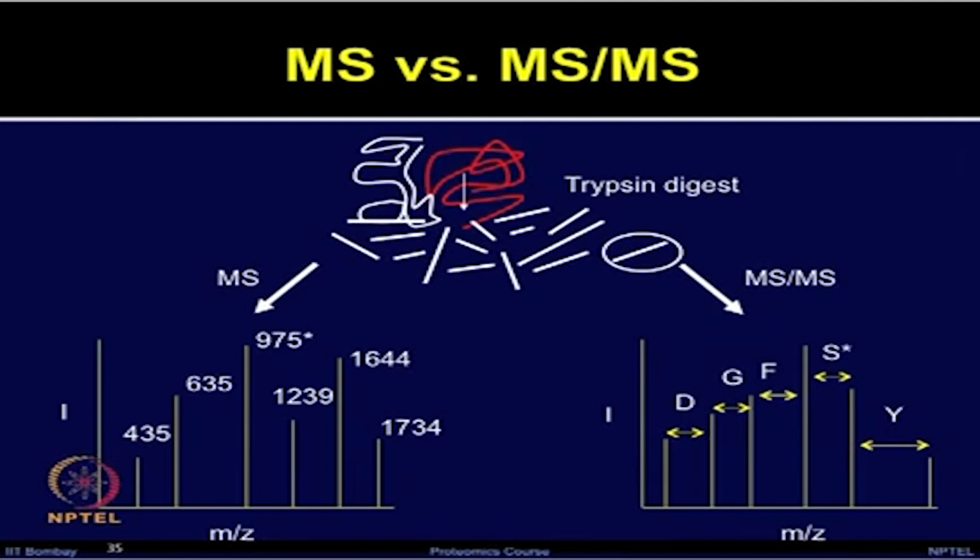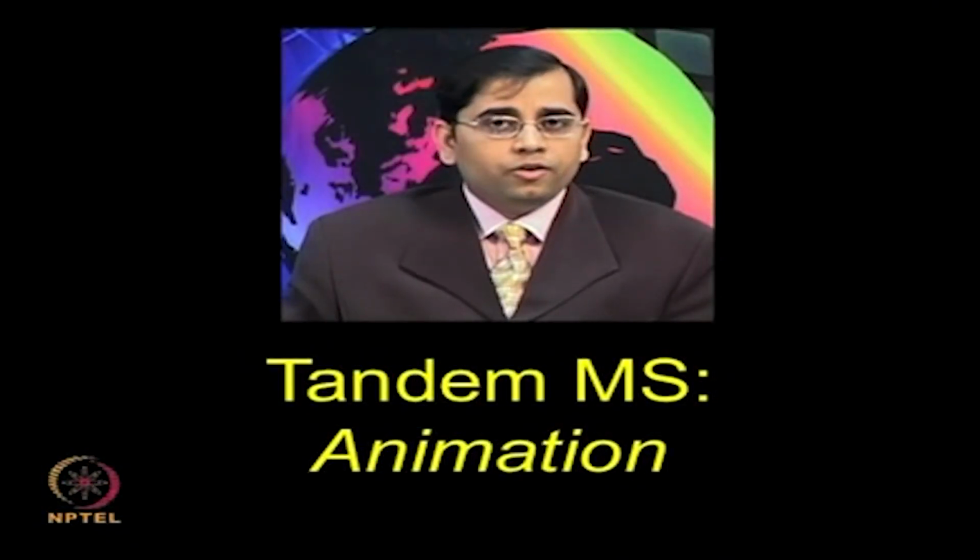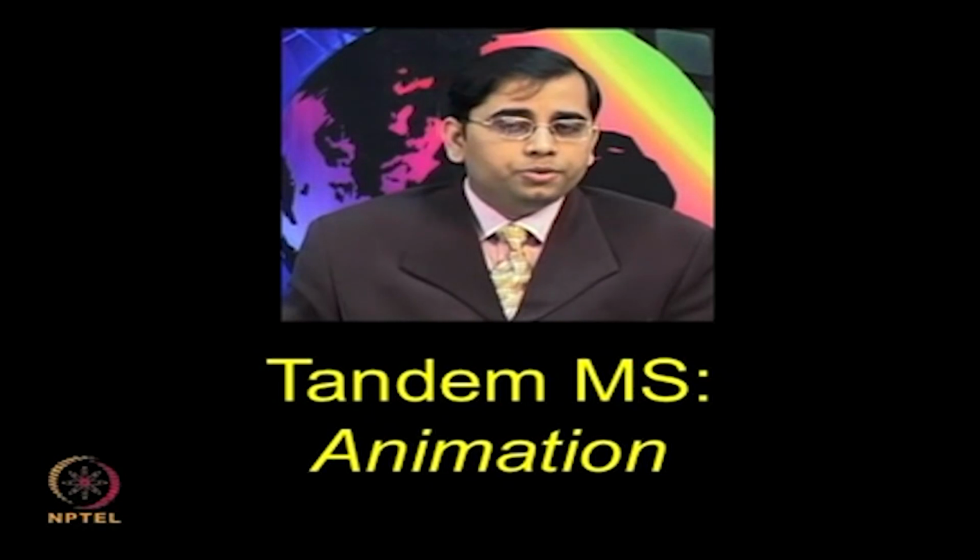The first stage can do selection of an ion for its subsequent fragmentation, and then in the second stage, this ion is fragmented by using different types of fragmentation methods such as CID or ECD, and then sequence information may be obtained via de novo analysis of the spectrum. For some of the commonly used tandem MS configurations, let me show you this animation.